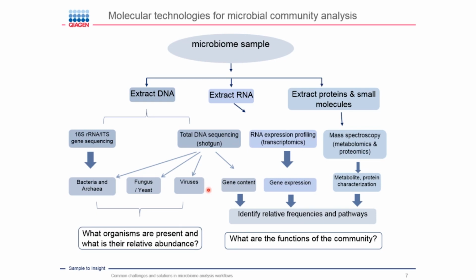This leads in the end to the need for a high sequencing capacity per sample. So you have to do really high coverage sequencing. You have a lot of data because you not just have a short amplicon, you sequence entire genes, entire genomes. It gives you a lot of additional information, but sometimes you just want to know how is the distribution of different strains.